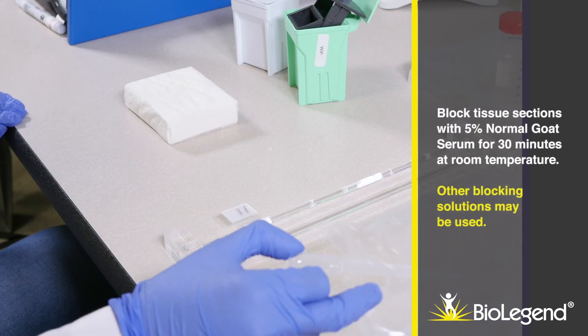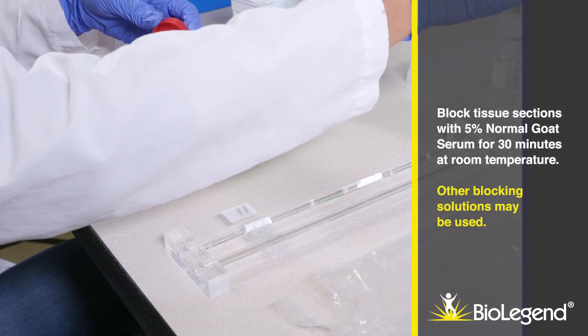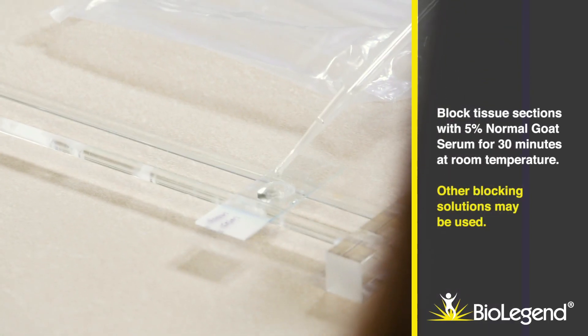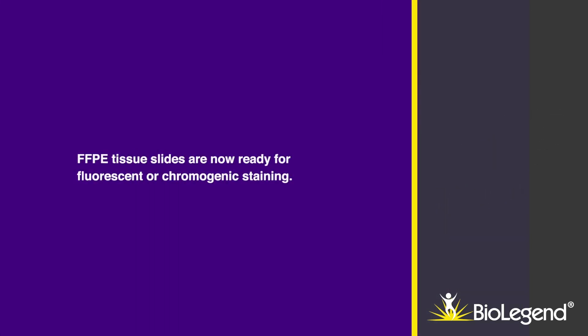Block tissue sections with 5% normal goat serum for 30 minutes at room temperature. Other blocking solutions may be used. Formalin-fixed, paraffin-embedded tissue sections are now ready for fluorescent or chromogenic staining.